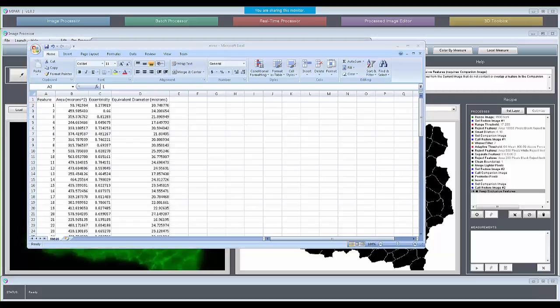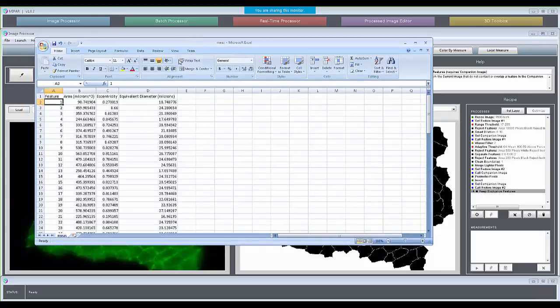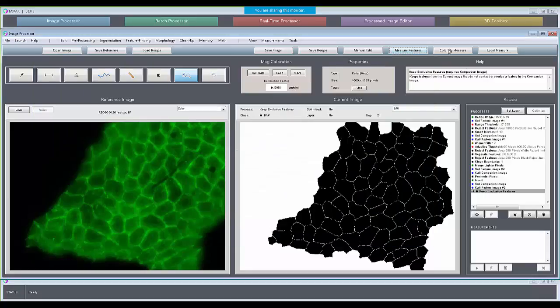Oh, you're very welcome, Reagan. Thank you. Shape parameters in general, aspect ratio, nice. Yes, so aspect ratio is, I guess, not exactly eccentricity, Reagan, although they scale identically. We do have major and minor axis length as printouts, and I could show you that real quick.